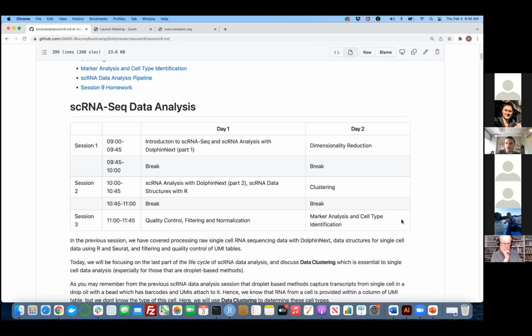Nazgul is asking, can we cut off the data and do filtering after normalization? Interesting question. When you do normalization, you can still filter using those quality control measures that we have used, and it's going to use the total UMI count calculated based on the raw count. So yes, you can, but I don't suggest doing that. The proper way of doing it would be to filter first and normalize later. But yes, you can.